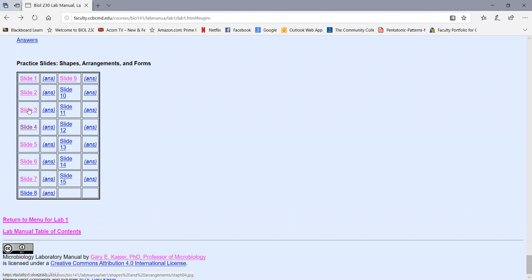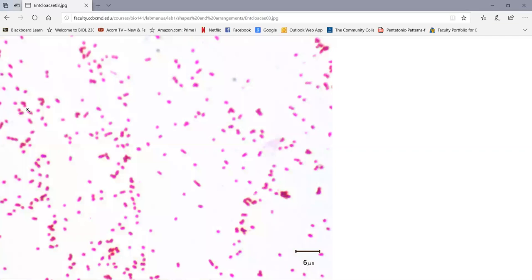And again, remember, you have to be careful on bacilli. People taking a quick look at that often say it's a diplococcus or coccus. It's not, it's a bacillus. This is an actively dividing culture. So most of these are undergoing binary fission. They're splitting in half. And once they do split in half and separate, they look like a coccus.